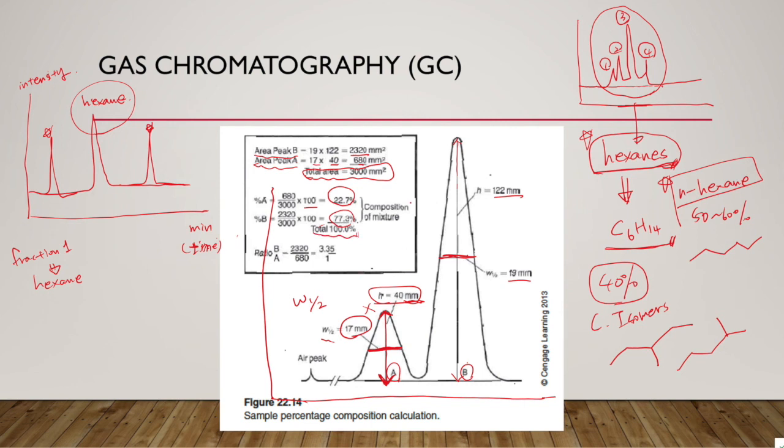Okay, so in the chromatogram provided for the fraction 1, you will expect to see these 4 peaks for the hexane, and we're going to just consider these all as hexane. So you probably want to add up all these numbers.